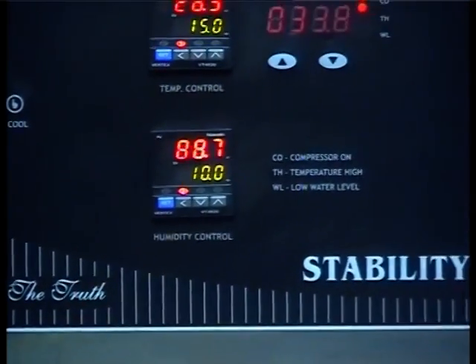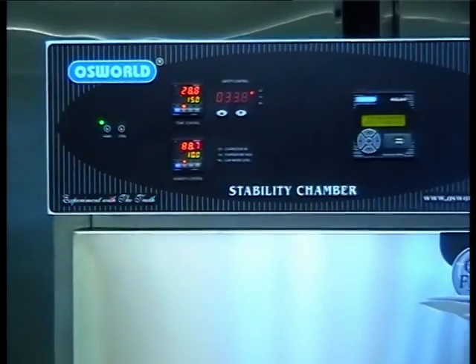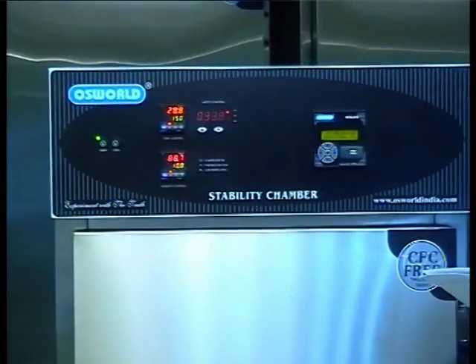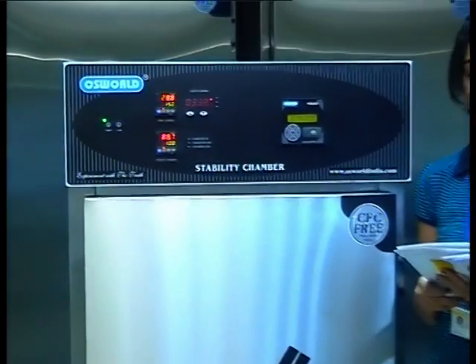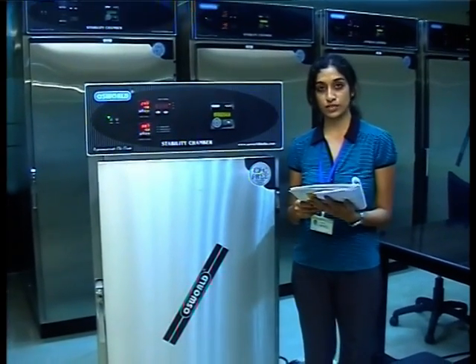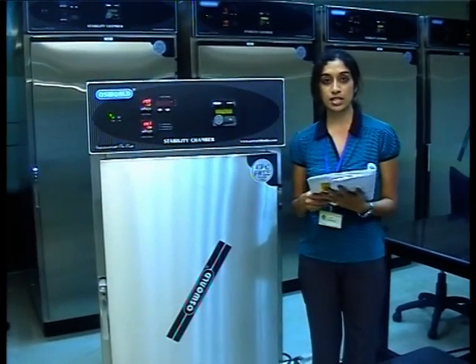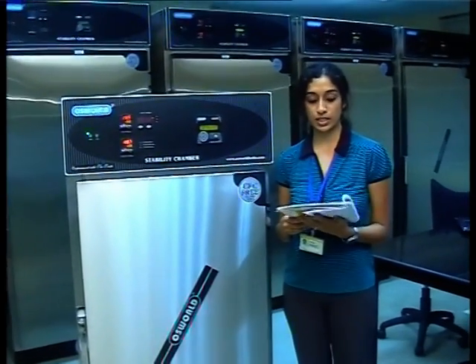The safety controller can be set to any temperature higher than the set value. Start the equipment. Observe that the temperature will drop from its present value, which is close to room temperature, to the set value of 15 degrees Celsius. The total time taken to achieve 15 degrees Celsius should not exceed 45 minutes.